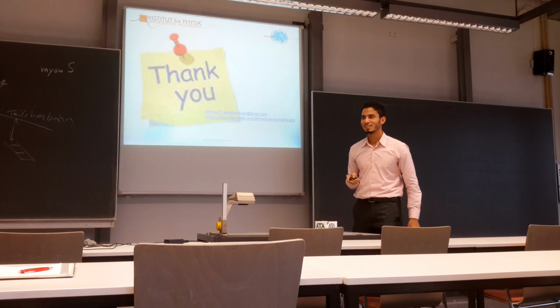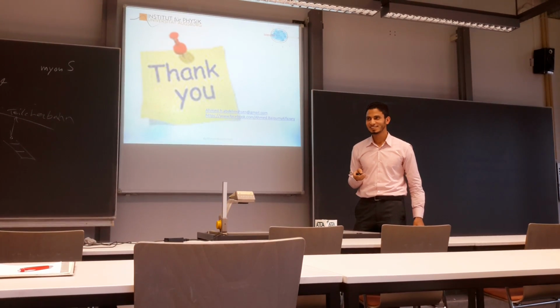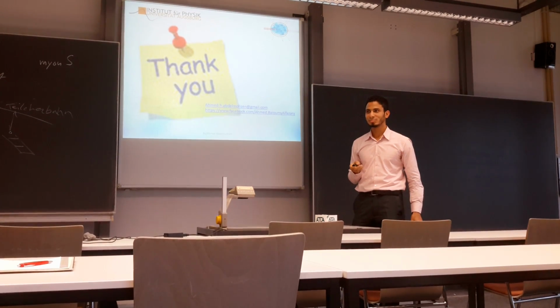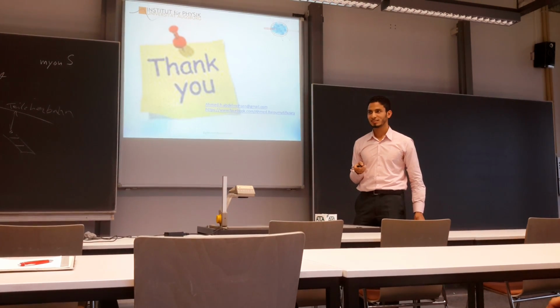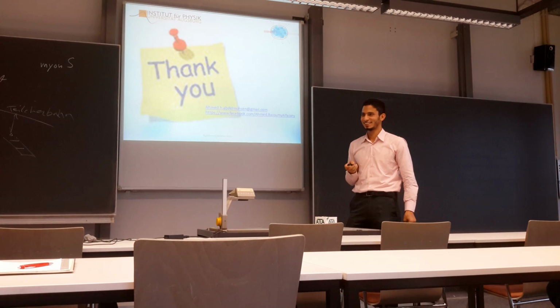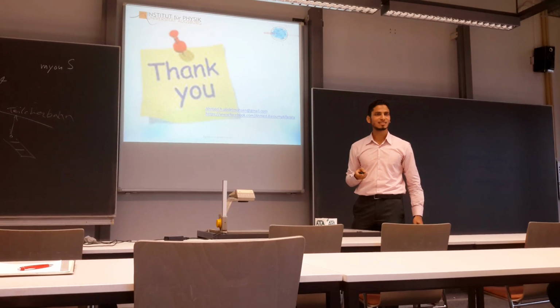Maybe practical points of view are also interesting. How is a real XRD measurement then finally worked with these cards and the comparison, where you try to match the peaks, and how to prepare the samples? Yes, even when you have a little crystal, a very tiny one, or powder diffraction. So are there other questions?